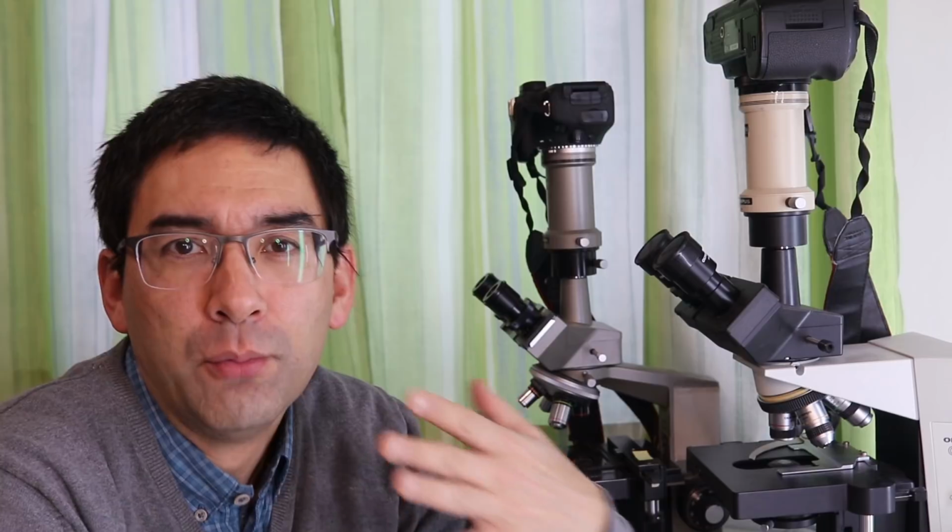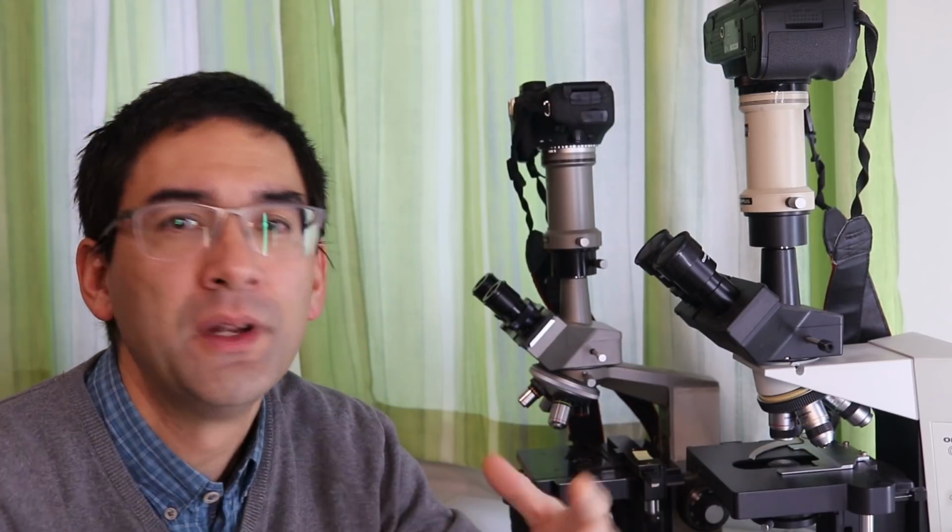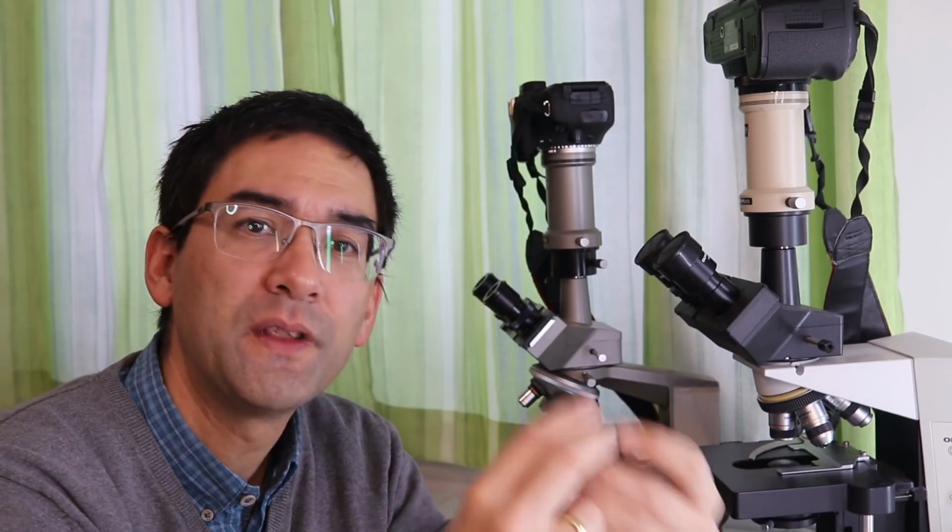At least from my use, I would have more use for a lower magnification eyepiece than a higher one, but that's also a question of personal preference. Okay, so that's basically one thing: magnification.